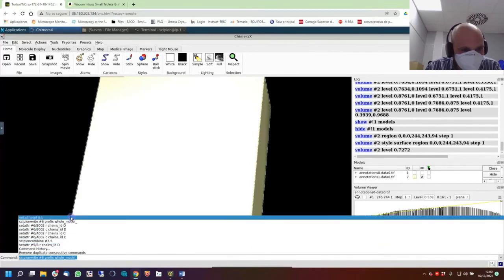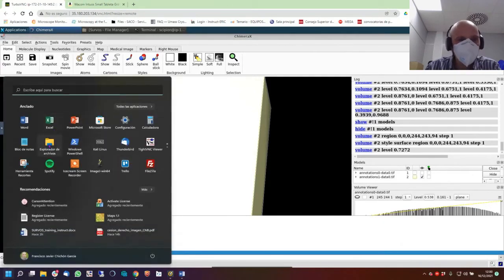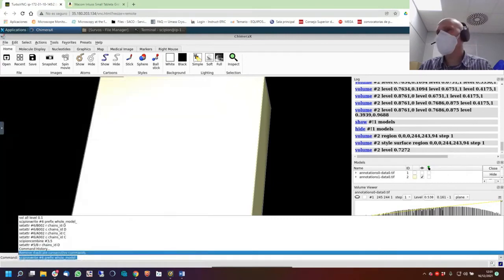No, I think they are there. Sorry, let me have one second. Chimera. Let's try to open the rest of them. There is a command line that we need to go for. I think that is here, but it's not.